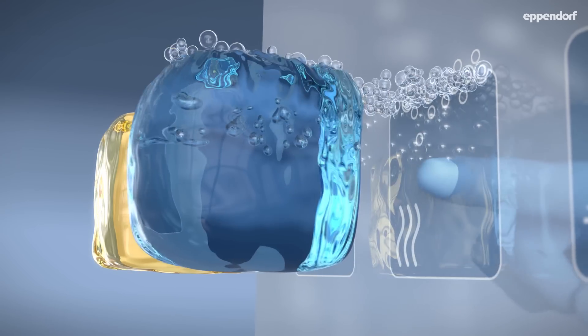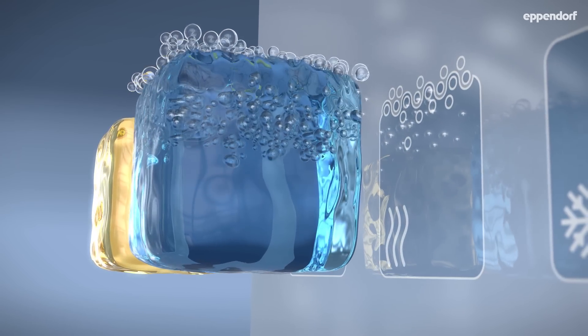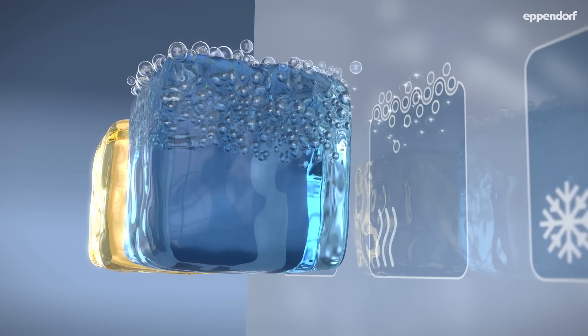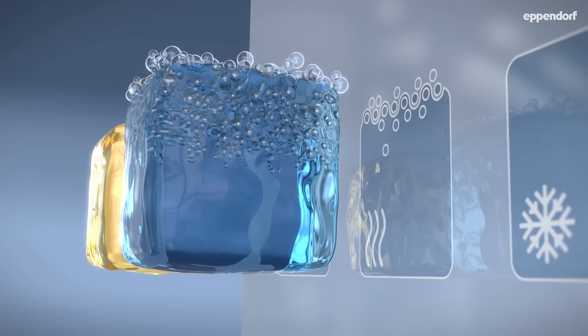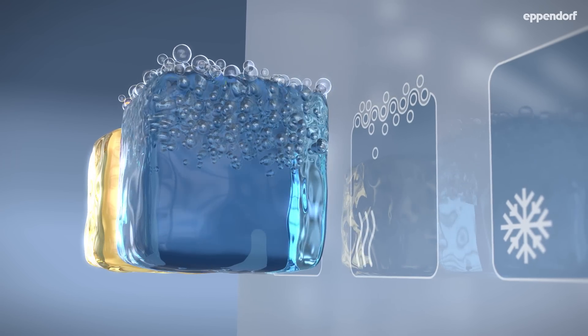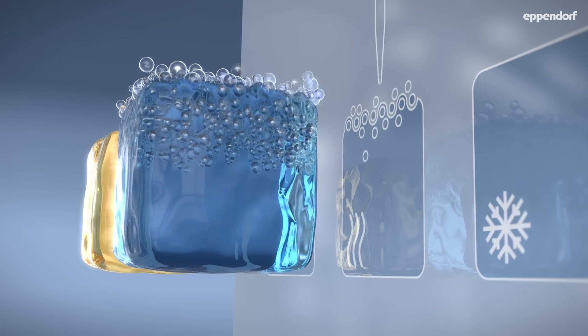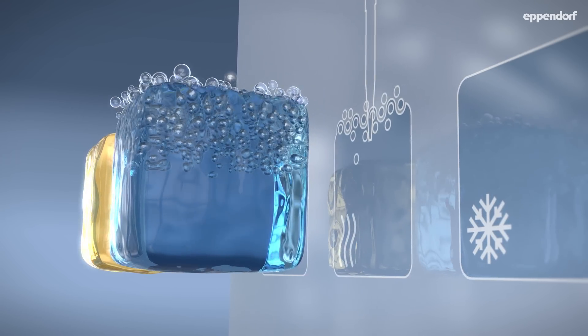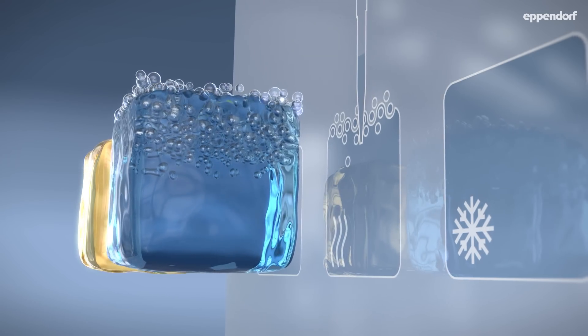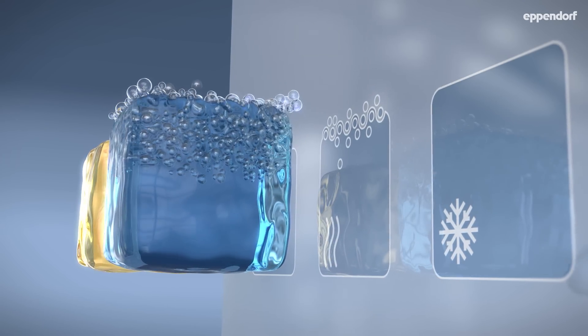Second, foaming liquids are difficult to pipette accurately, especially if they were moved or shaken before pipetting. If you use an air cushion pipette, we recommend that you use reverse pipetting to minimize foaming problems. A positive displacement dispenser is even better since it offers you perfect control.